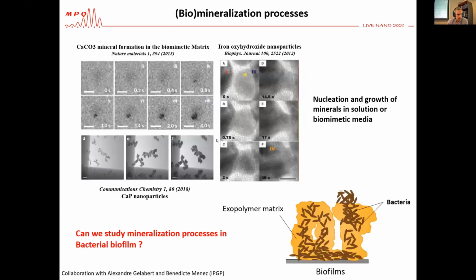Now, to finish, I wanted to show you some examples on the biomineralization process. The mineralization driven by bacteria in biofilms is known to be a crucial process in the cycling of metals in the environment.